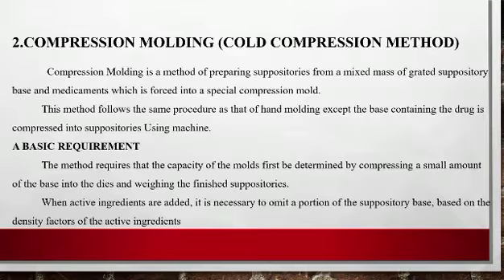Mainly, we have to take the suppository base. We have to grate that suppository base with the help of a grater. Next, we have to mix it with the medicaments and force it into a compression mold. It follows the same procedure as hand molding, except the base containing the drug is compressed into the suppositories using a machine.